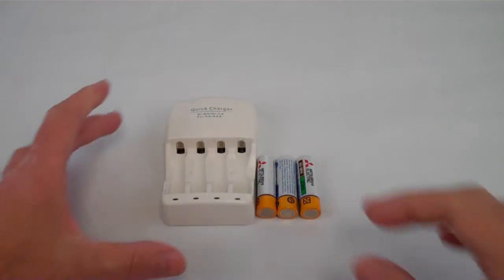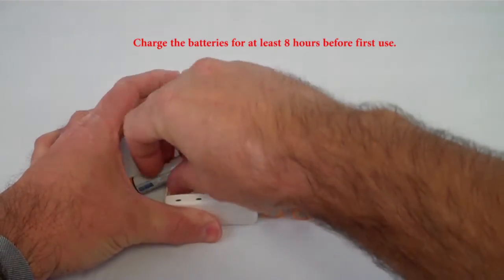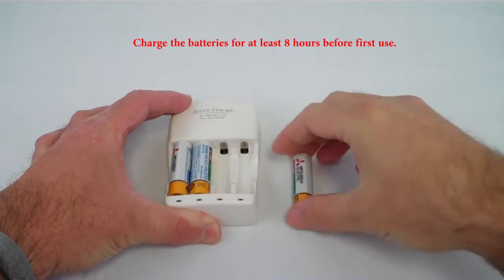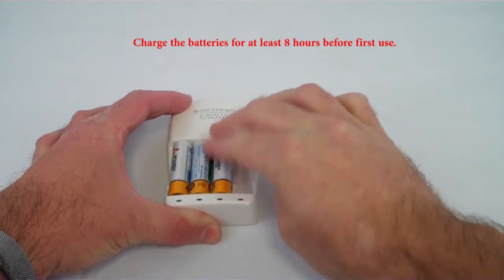The first thing you'll do is put the batteries in the charger and allow those batteries to charge for at least eight hours before the first use.